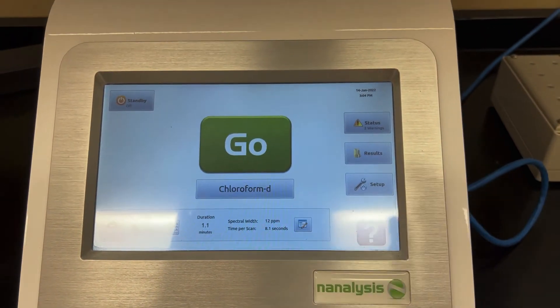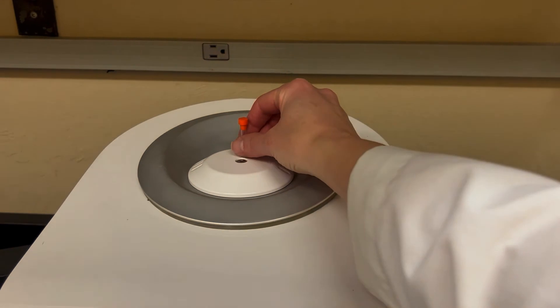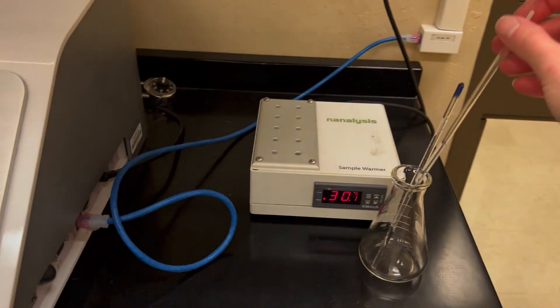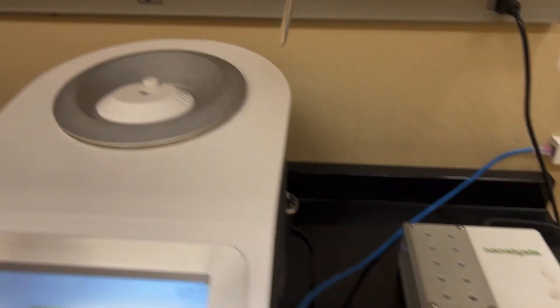When you're done you're just going to push done and then make sure to take out your sample and replace it with the reference sample again.